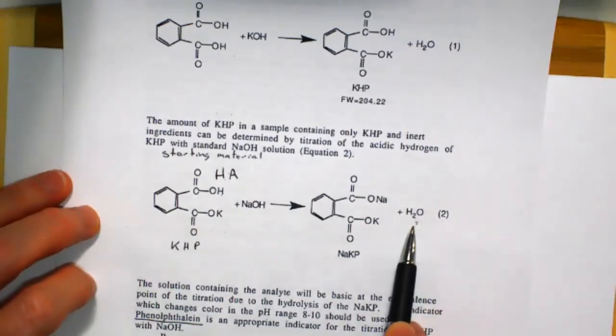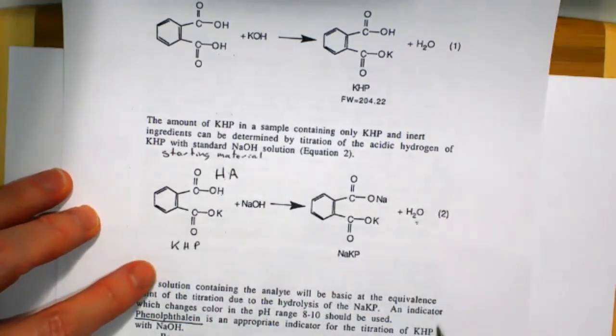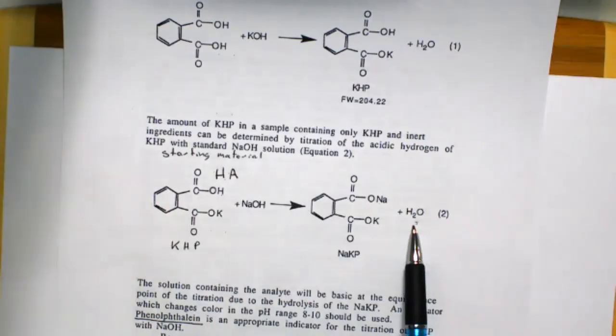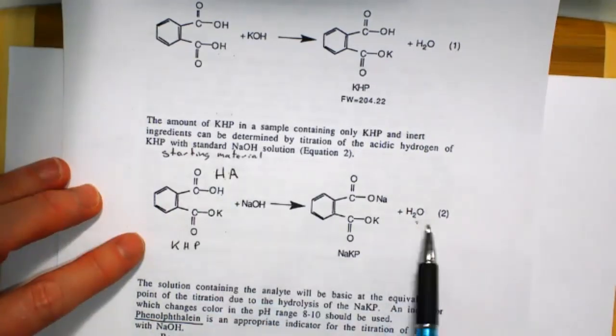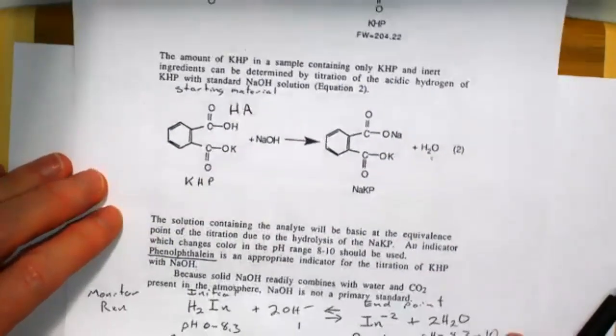They used a color indicator. And yeah, back in the day, that was something people would do. But please don't, why did I even mention? Don't drink your chemical experiments. That's safety rule number 1.